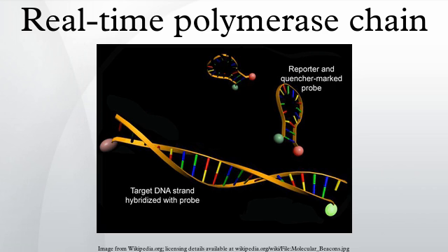Fluorescent probes can be used in multiplex assays for detection of several genes in the same reaction based on specific probes with different colored labels, provided that all targeted genes are amplified with similar efficiency. The specificity of fluorescent reporter probes also prevents interference of measurements caused by primer dimers, which are undesirable potential byproducts in PCR.